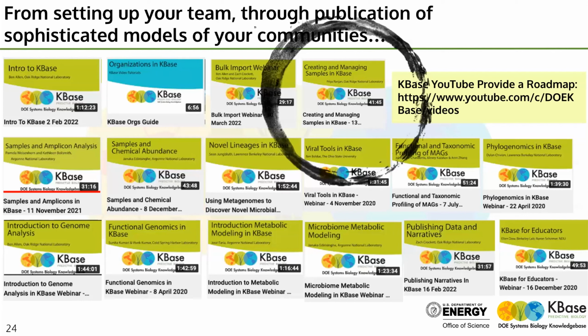Now, as you load data into the system, you want to organize it in terms of samples. Conceptually, a sample is the physical element that you are observing in the field, and a particular set of measurements associated with a space-time location of that sample. For example, if you take a piece of sediment from the field, it was taken from a time-space location in the field. It has some volume and extent. Then we might make measurements of it, such as its pH, its chemistries, its amplicon content, or its metagenomic content, and so on. We want all those different measurements to be associated with that single object.